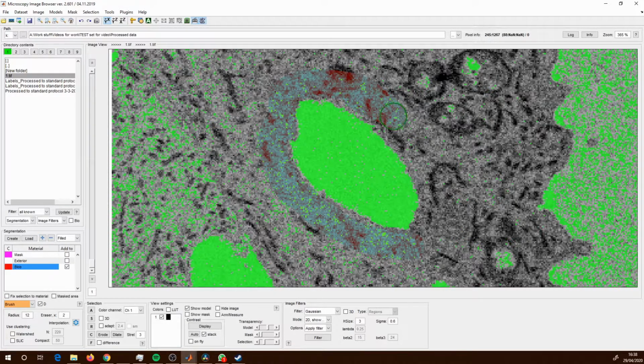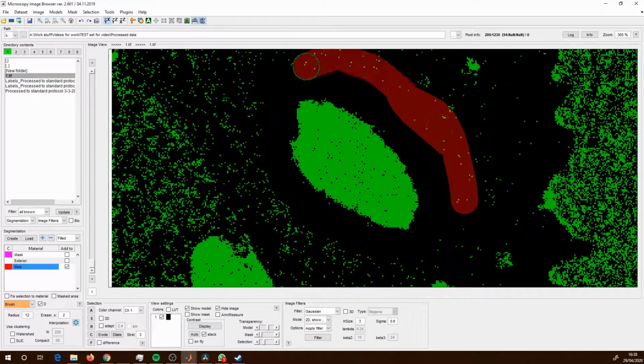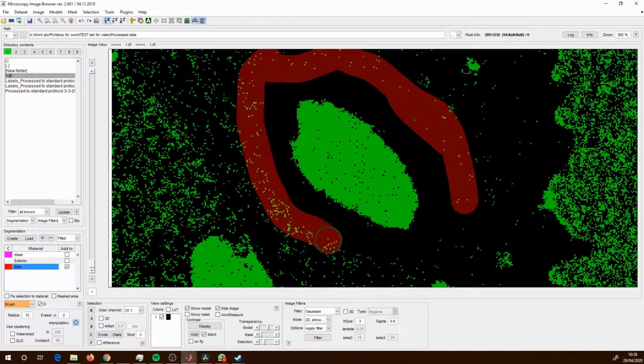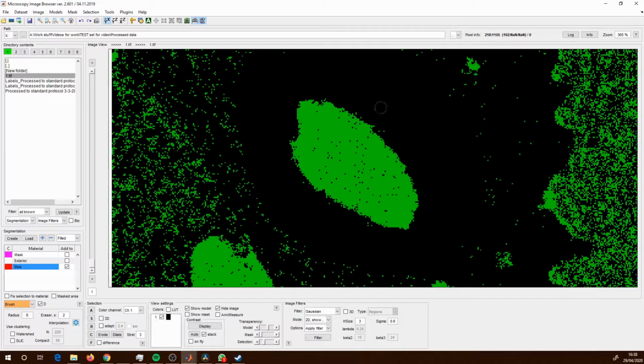And remove the erroneous selection around the object. If we look at that without the image now, you can see that it's removed a lot of the debris around the outside. This is a slightly slower way of doing it, unless you're just doing one object. You can also fill in this object as well to make it more substantial and solid.